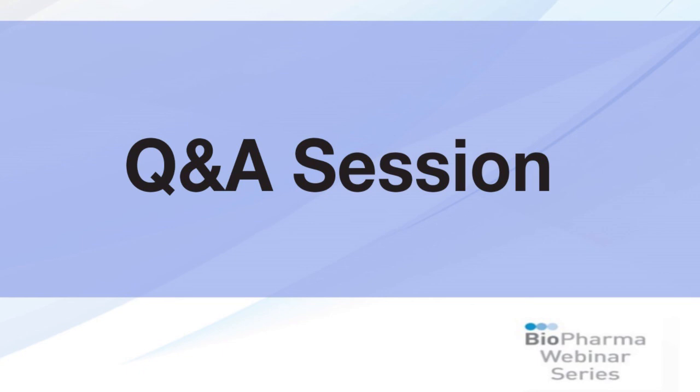The next question will be our final question. Which factors or responses can be considered in QbD if NIR is selected for characterization? I'm trying to understand the question. So which factors or responses can be considered in QbD? Anything that the NIR can pick up is an important thing in QbD.